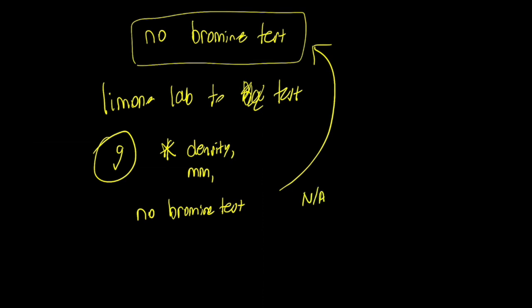All right, what's the purpose of these materials during the experiment? Phosphoric acid we've talked about, sodium carbonate we've talked about, anhydrous calcium chloride we've talked about. Why did the procedure call for ice to chill the receiver flask? We've talked about that. Why couldn't hydrochloric acid have been used instead of phosphoric acid? We alluded to that. You might want to look up the boiling point of hydrochloric acid.